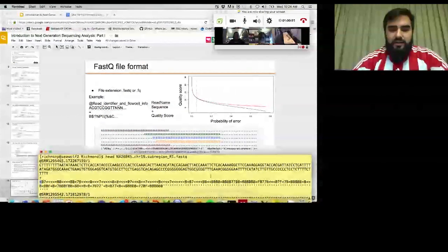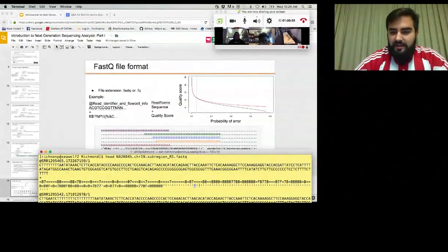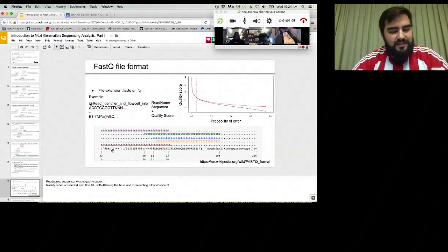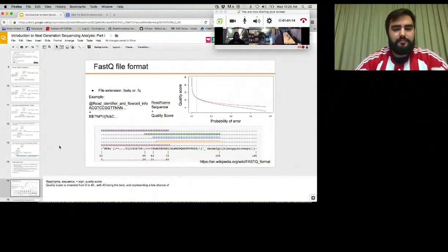But if you look near the end of the read, which is quite common for these much longer reads, especially over 200 base pairs, you see that we start to get a lot of these single apostrophes. The apostrophe is a quality score of 6, which is much worse, and those are probably going to be some sequencing errors near the end of the reads.